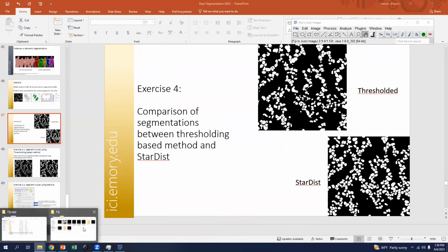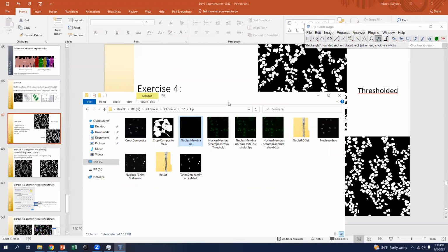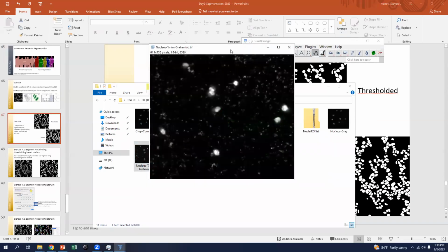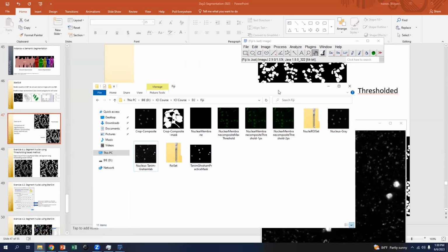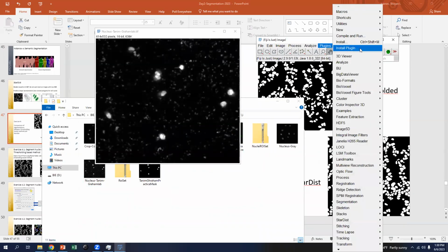We have a complex image here. That is, this one? No, it's this one. I might not have it on here. Give me a second. Oh, we can work on this one anyway.